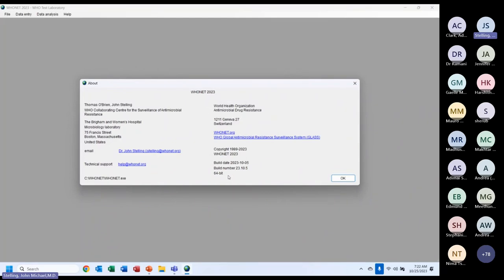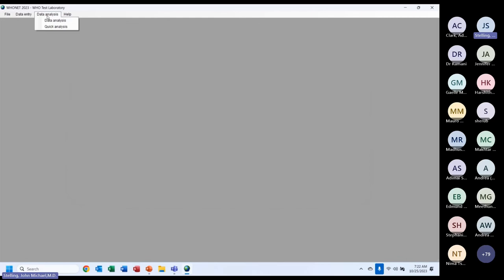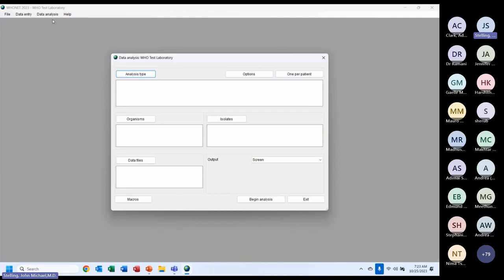Back on the main menu, under data analysis there are two options: data analysis for interactive analysis where you choose the details, and quick analysis — we'll come back to that later. Going to data analysis, I'm at the Hoonet analysis screen. There are three required questions on the left: what kind of analysis do you want to do, which organisms, and which data files. With those three questions, you can begin your analysis.